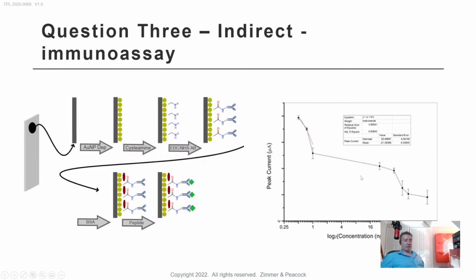It was a bit stepwise, and I think it's really just doing the work more and refining the process. The error bars are not so disturbing to me. I think they need to be decreased. So there is definitely some improvement for this assay. And I think the improvement that I would actually make if we were doing the work again is to just make it simpler. I think the gold nanoparticles is a step that's really not required.